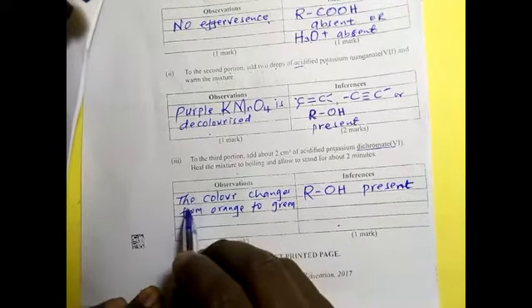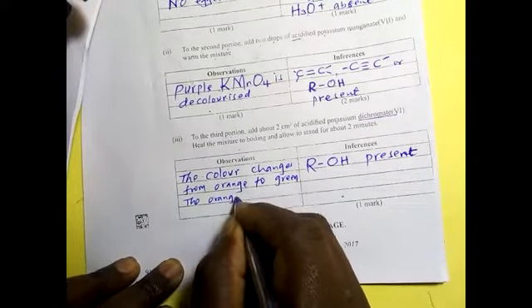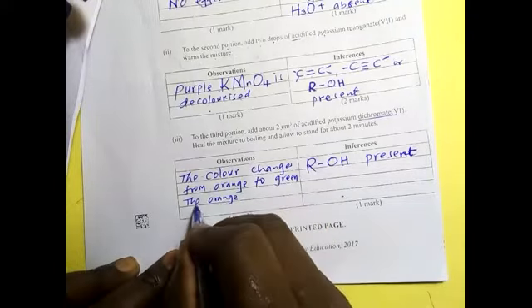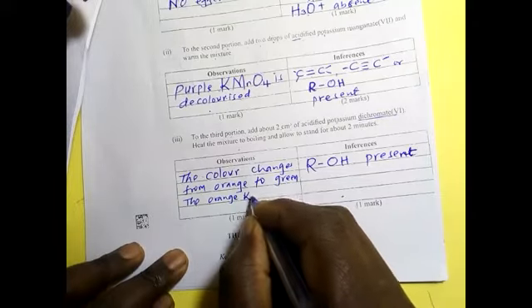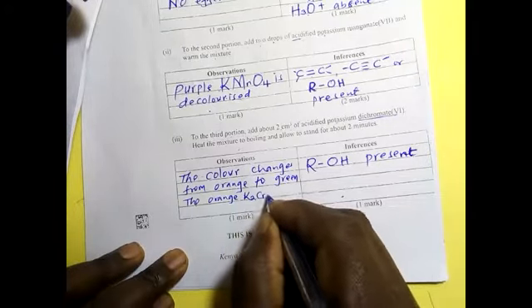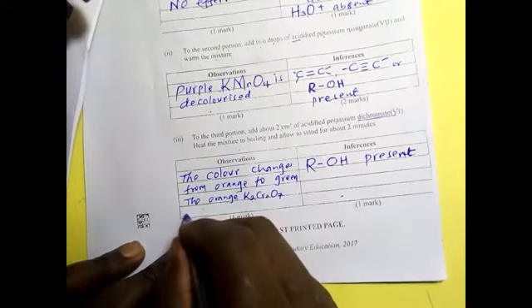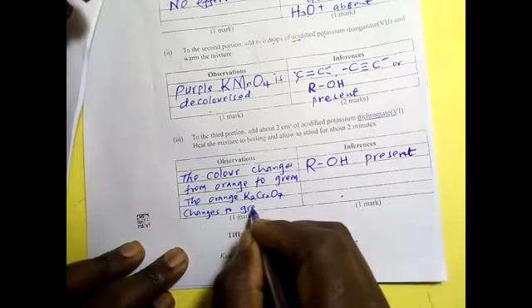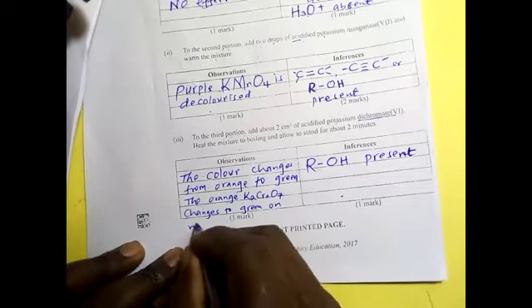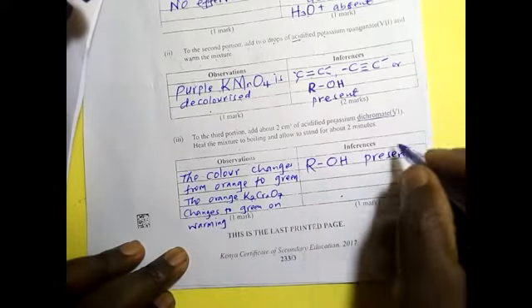So how else can you state the observation? The way you can state this observation is that the orange acidified potassium dichromate changes to green on warming or on heating, whichever, on warming. So this one is present.